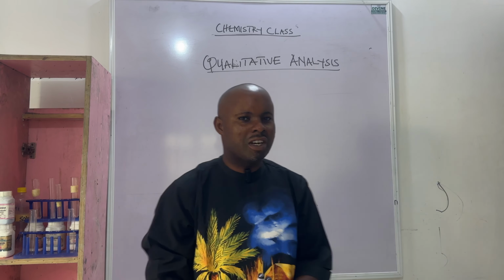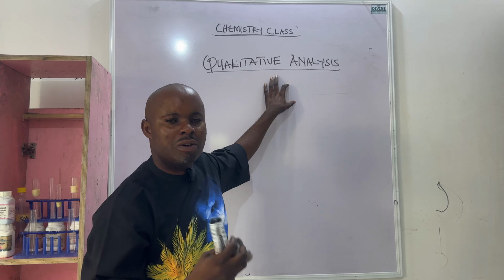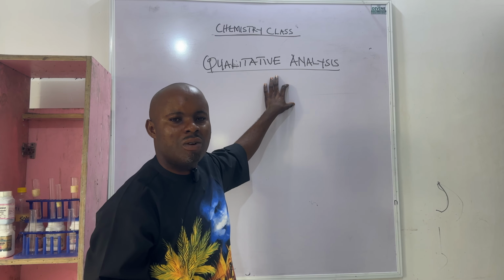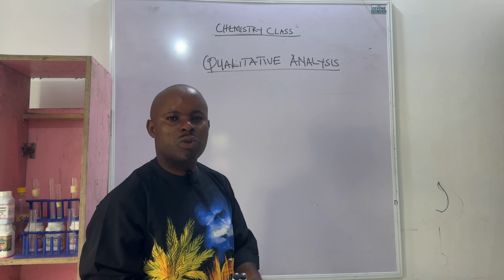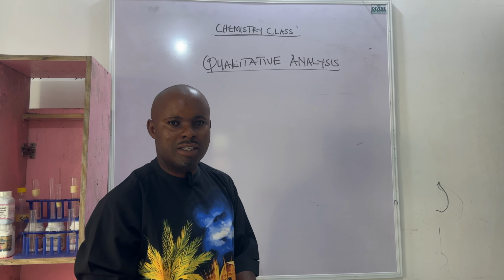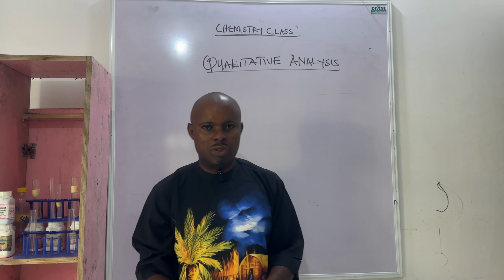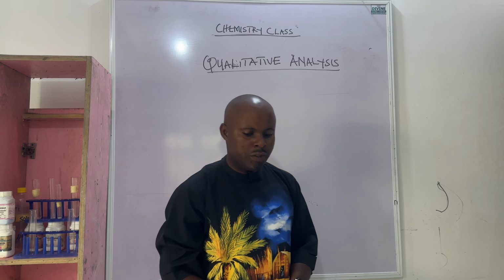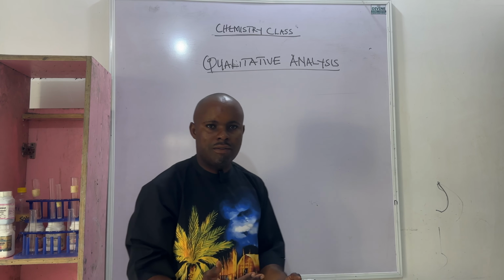In today's topic, we'll be talking about qualitative analysis. In this aspect of chemistry, we are going to apply our knowledge of practical chemistry. What we mean by qualitative is that we're going to know about the quality of a substance or compound. In this aspect, we'll be dealing more with the SSC chemistry aspect of qualitative analysis. So in today's topic, we'll talk about qualitative. What do we mean by qualitative analysis?